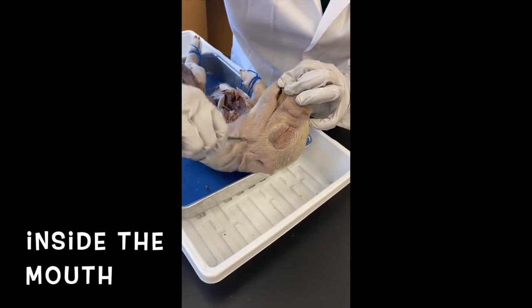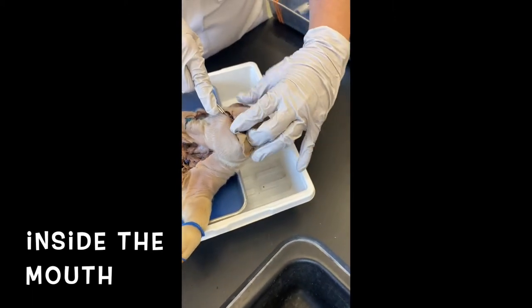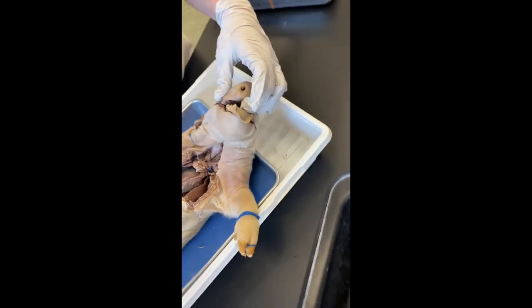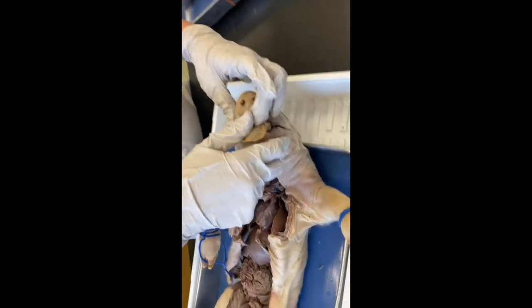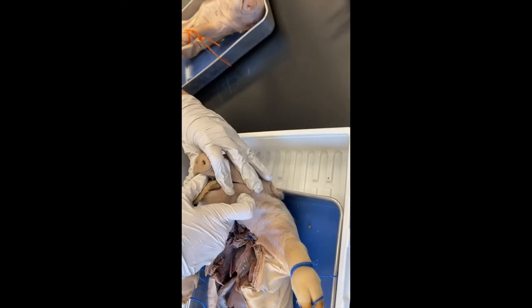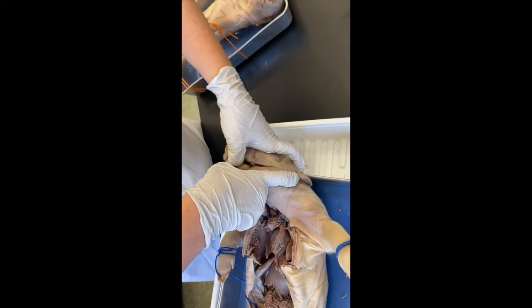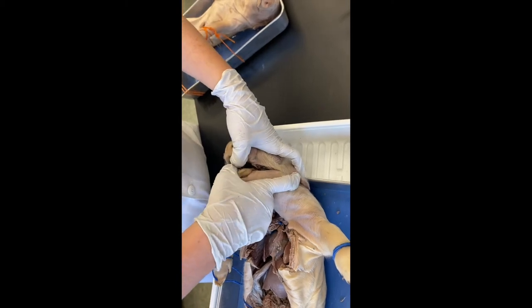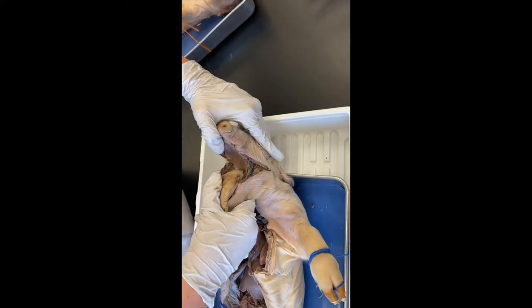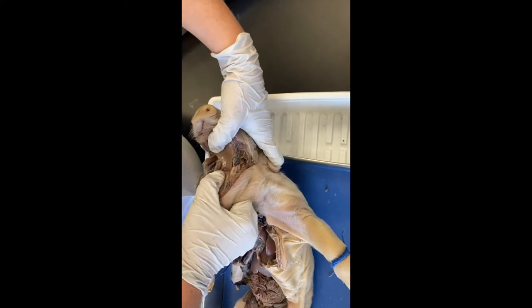Correct. And one of the most interesting things here that I'm going to show you is the flap at the back of the neck. It's called the epiglottis, and it keeps food from going into our lungs. And I can tell you, my brother's grandfather-in-law had a stroke, and he was paralyzed in his epiglottis, so he had to have a feeding tube. Because it didn't work anymore, and the flap did not work in being able to keep food out of his lungs. So okay. It's back here. So here I am opening the mouth. So we're going to be looking at the beginning of the digestive system here.